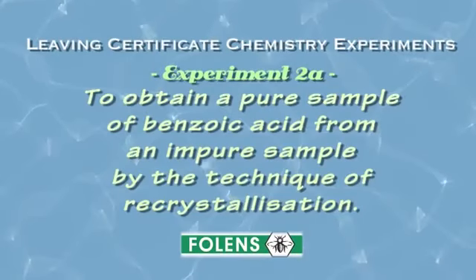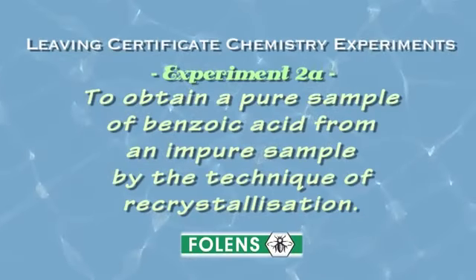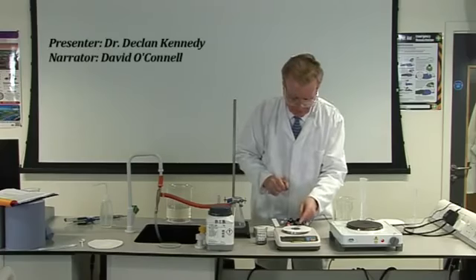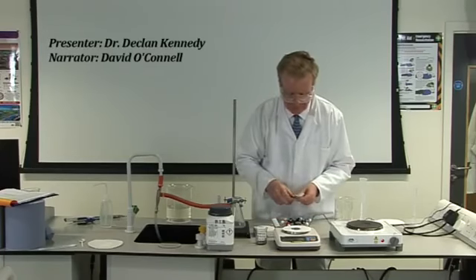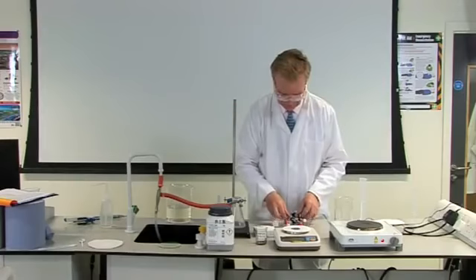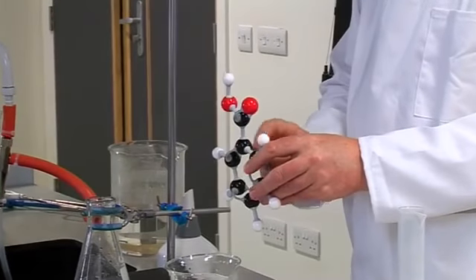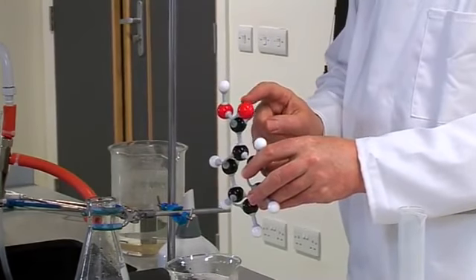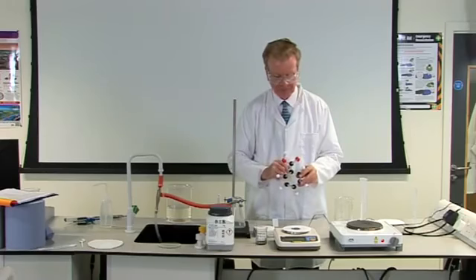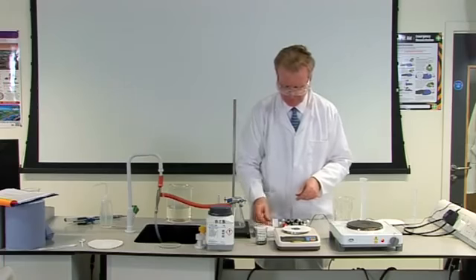Experiment: to obtain a pure sample of benzoic acid from an impure sample by the technique of recrystallization. In this experiment, we will use a technique called recrystallization to purify a sample of impure benzoic acid. Benzoic acid is a crystalline substance that contains molecules of formula C6H5COOH. The process of recrystallization is the most common method used to separate a solid material from solid impurities.